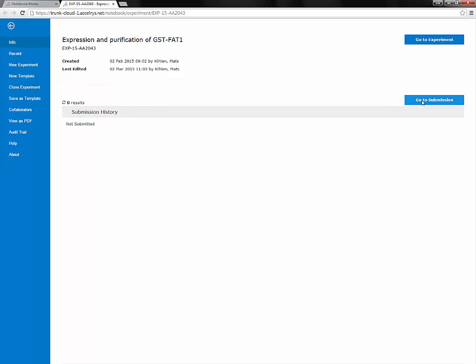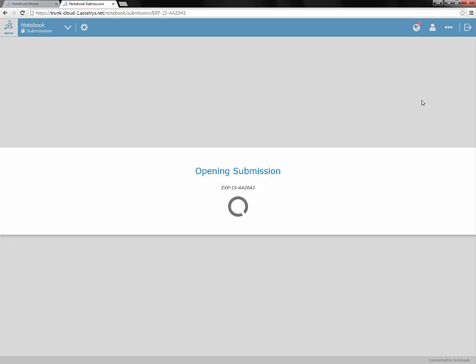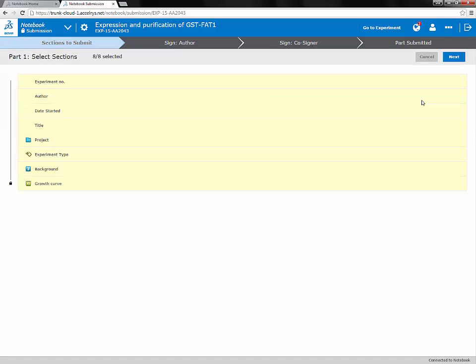Submission workflow has now been broken up into different sections. Rather than choosing which sections you want to submit within the experiment, you choose it at the beginning of the submission workflow.